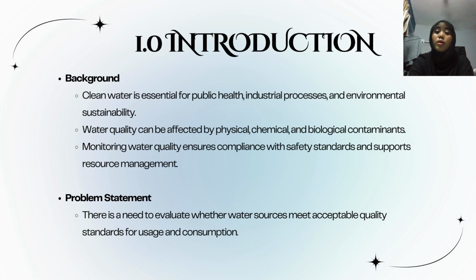This leads us to the problem statement. There is an ongoing need to evaluate whether local water sources actually comply with acceptable quality standards for human consumption and other uses. This experiment will give us the tools and data needed to assess that by analyzing parameters such as turbidity, pH, dissolved oxygen, and more.